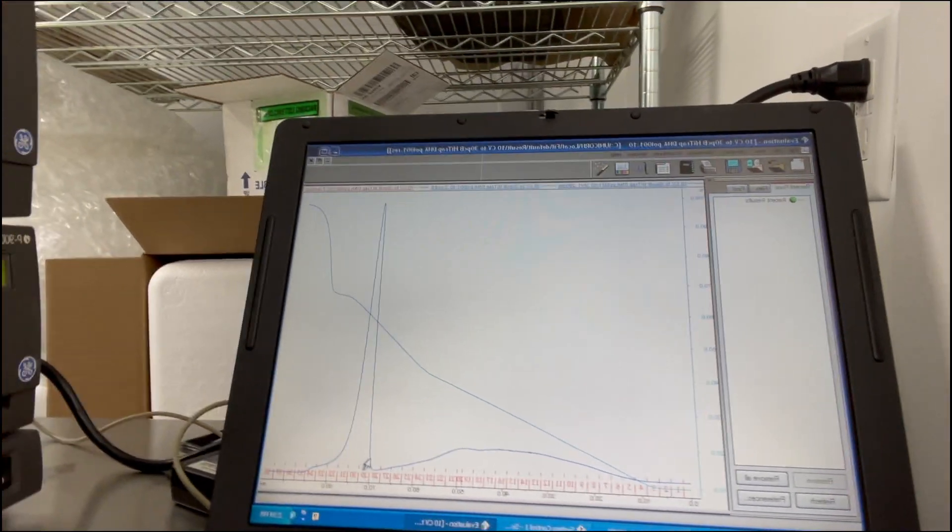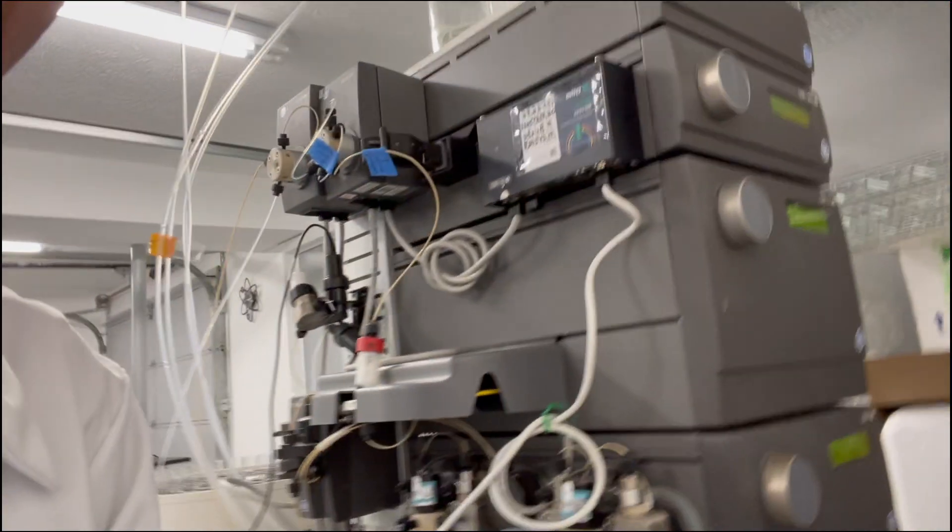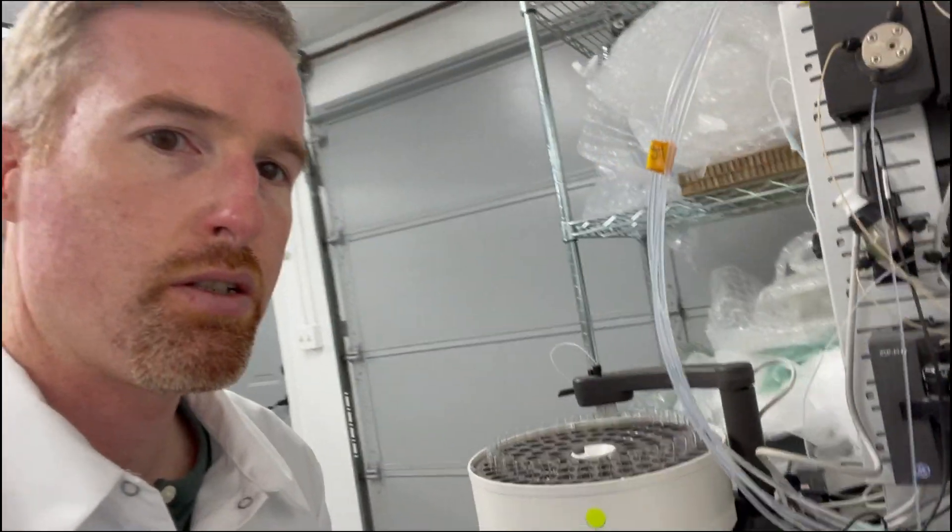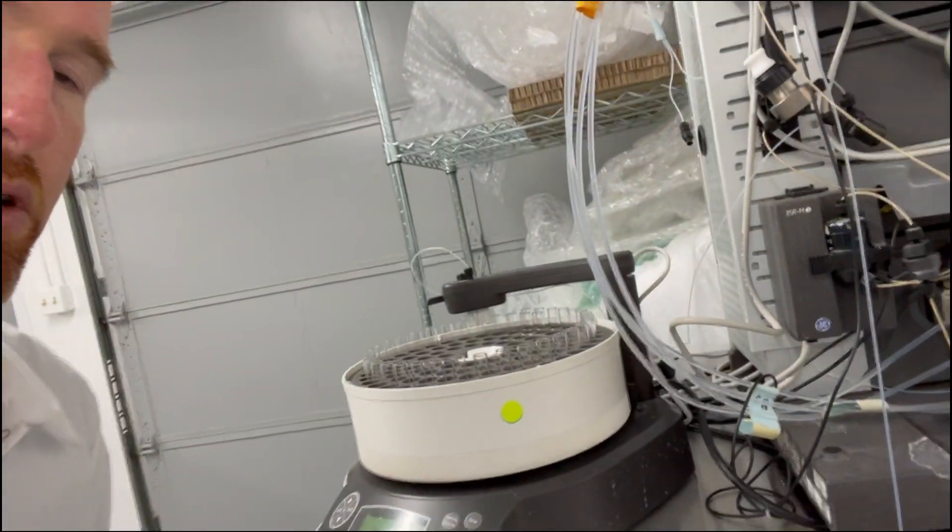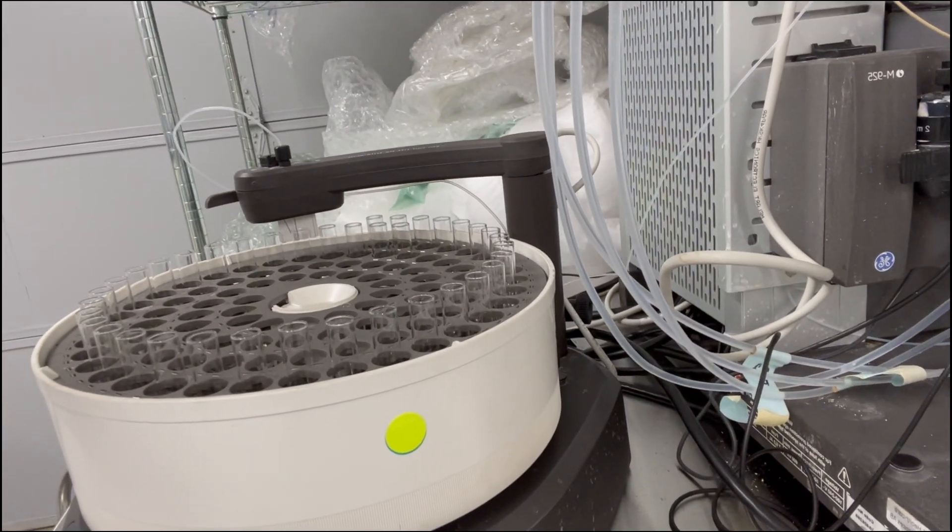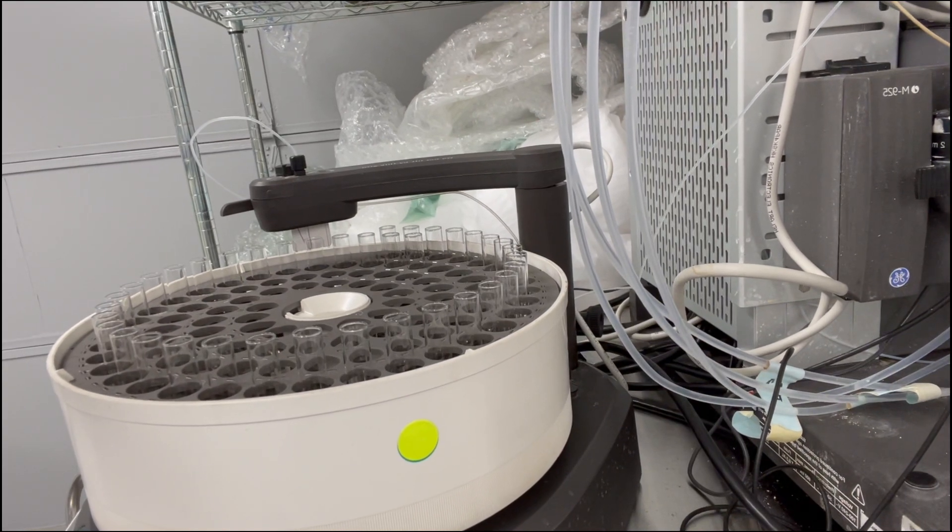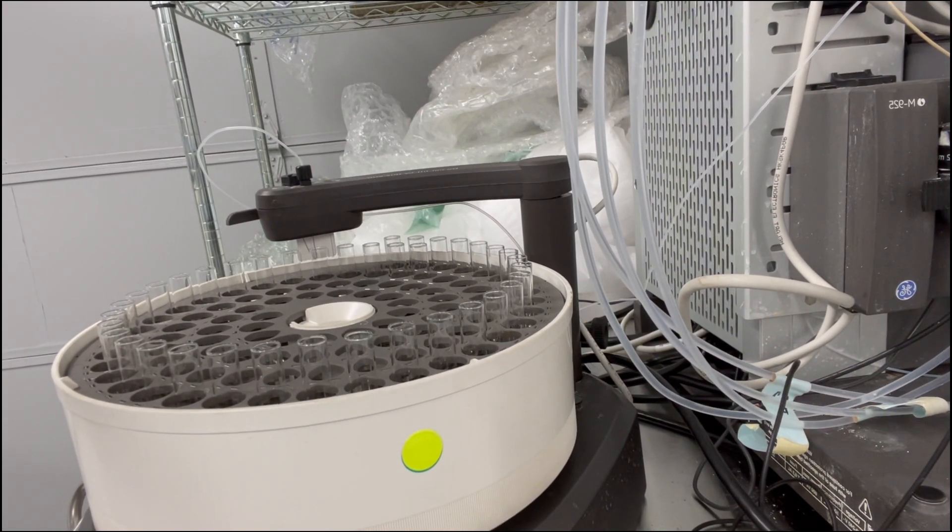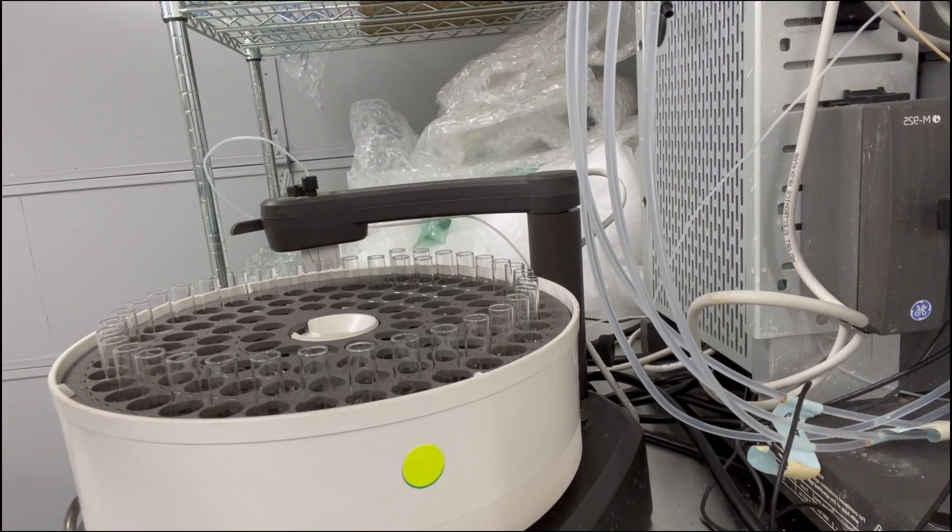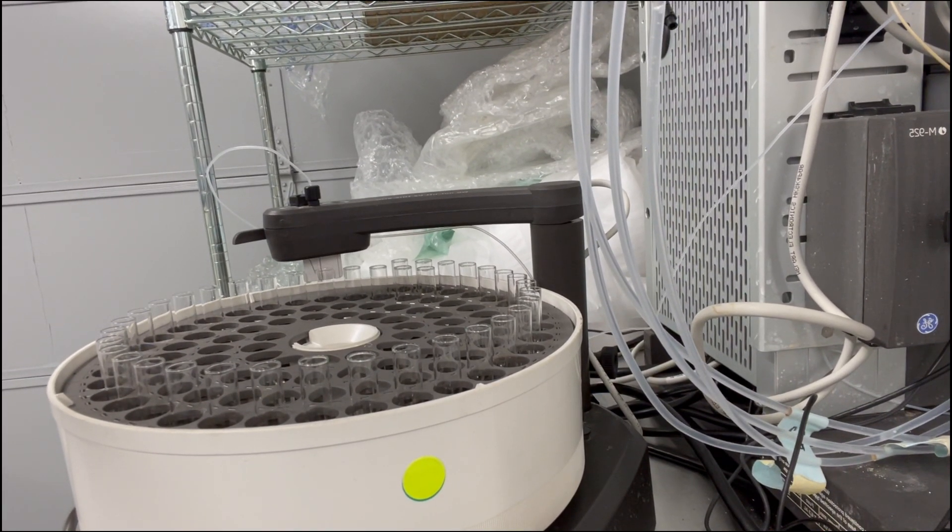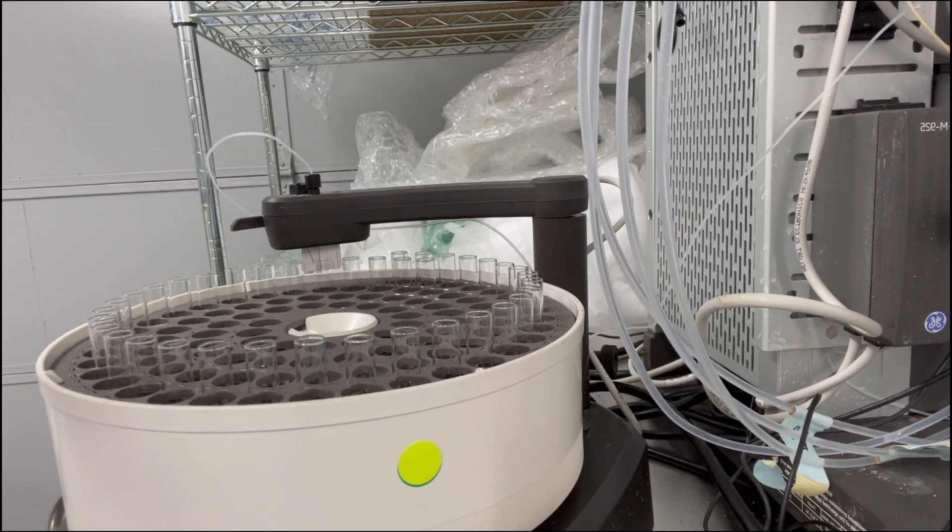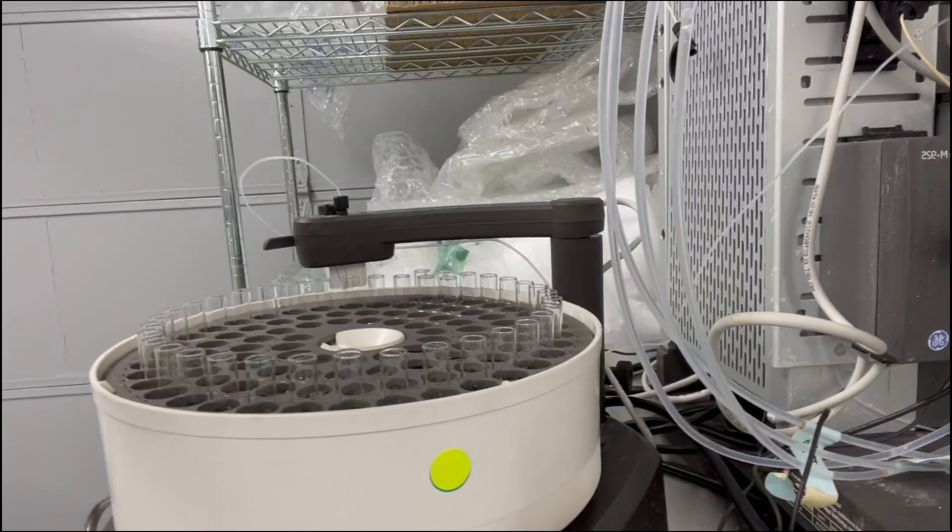So what I'm going to do next is I'm going to take all the fractions that are eluted from those peaks, find them here in the fraction collector, and run them on an SDS page gel to see which fractions have my protein of interest and have it in a pure enough form for my experiments. And then I'm going to combine those fractions for the next step.